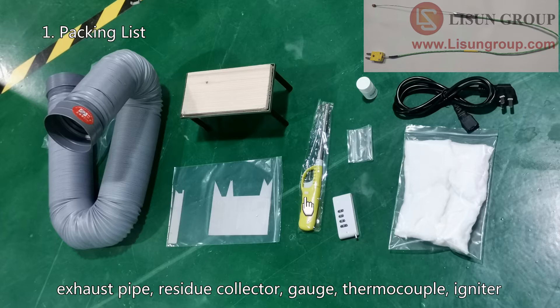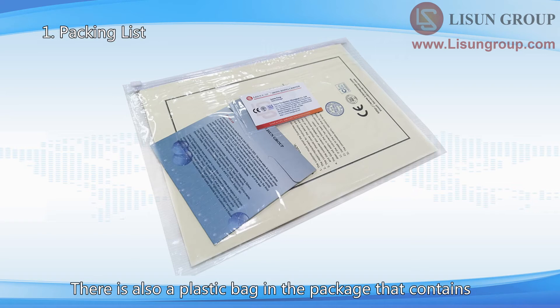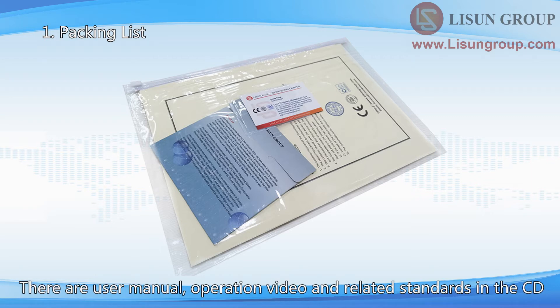The accessory box also contains a gauge, thermocouple, igniter, potassium permanganate, spare fuse, remote control, power cord, and cotton. There is also a plastic bag in the package that contains a CD, calibration certificates, and guarantee cards. The CD includes the user manual, operation video, and related standards.